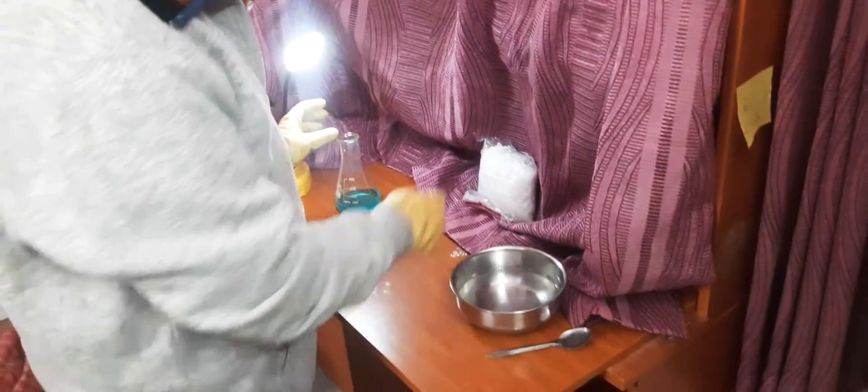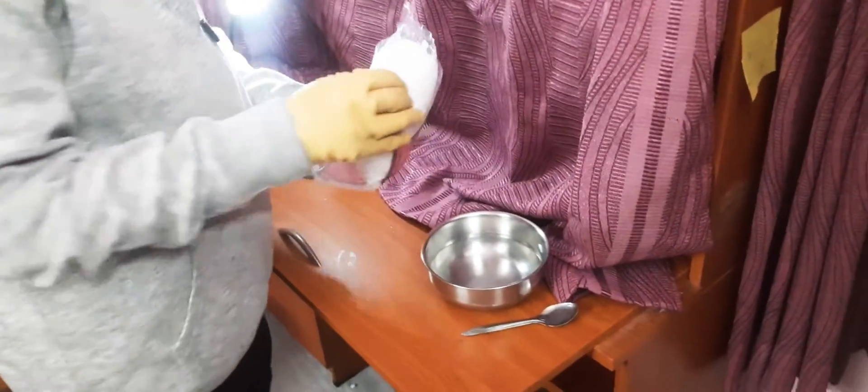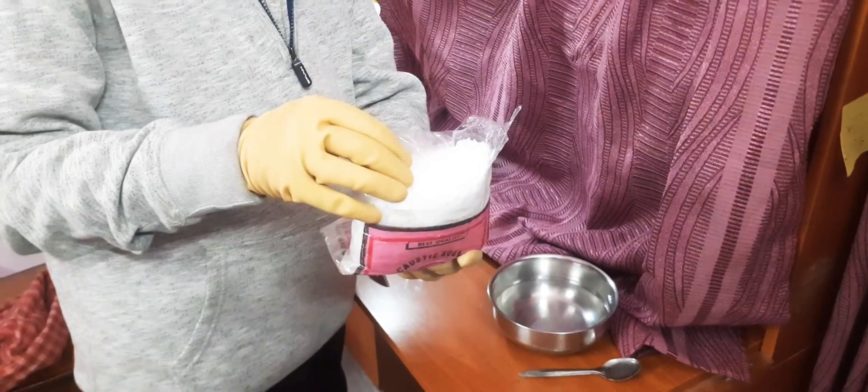Hello guys, welcome to Universal Science. Today I'm going to be showing you a well-known experiment of copper sulfate and sodium hydroxide, also known as caustic soda. So let's start.